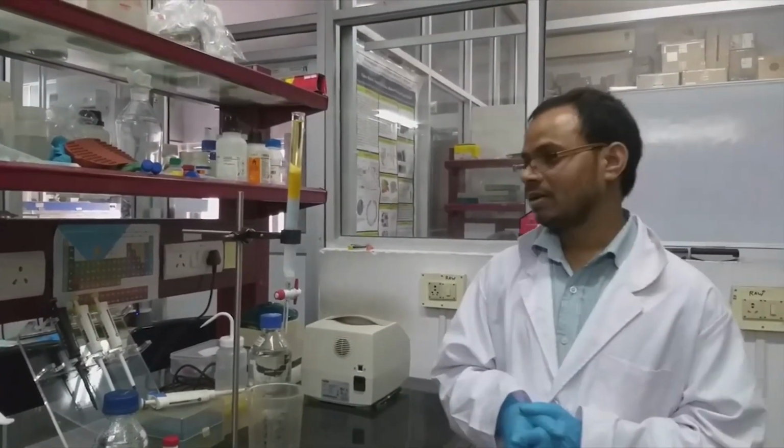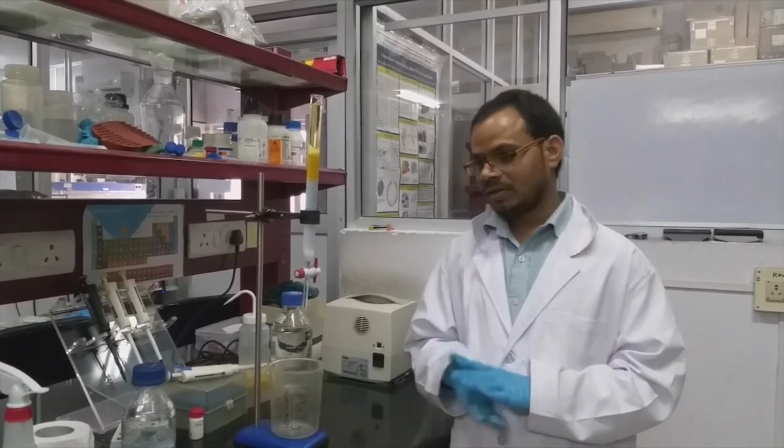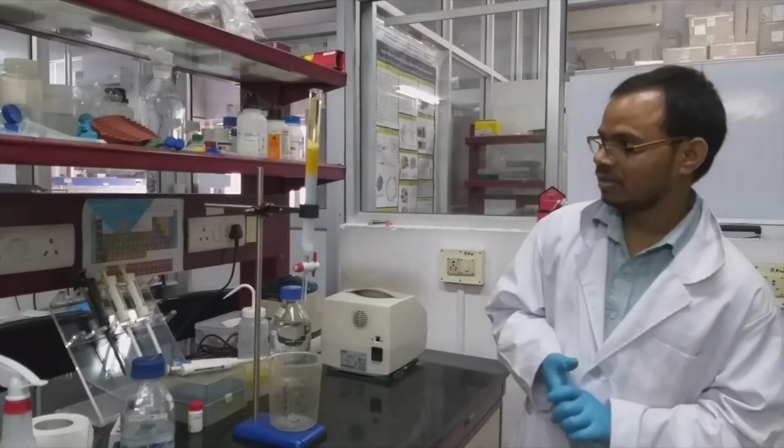With this, we understand that gel filtration chromatography is a very advantageous technique for separation of proteins, peptides, and oligonucleotides. And during this experiment, we have to remember a few more points and follow them cautiously.